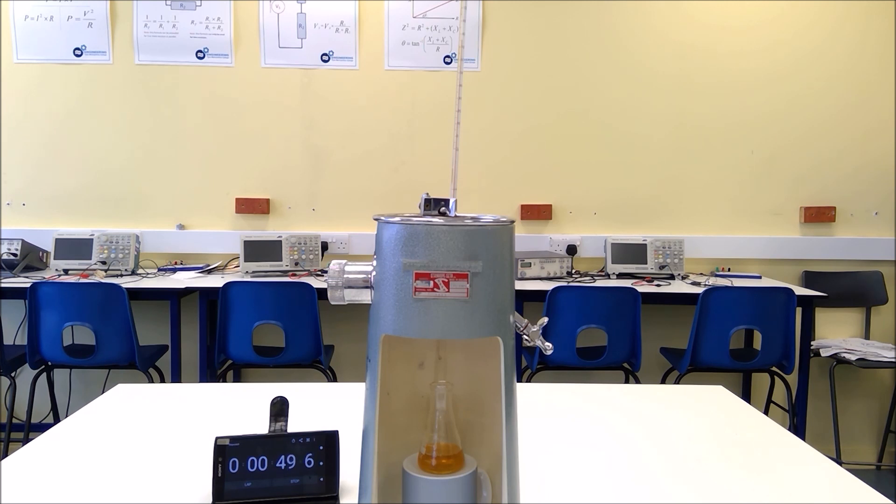Already we're at 20 millilitres. We're just passing 30 millilitres, and a quick check of the temperature of our oil shows it's still at 76 degrees. We're just passing 40 millilitres, and as we come close — there we are at 50 millilitres.